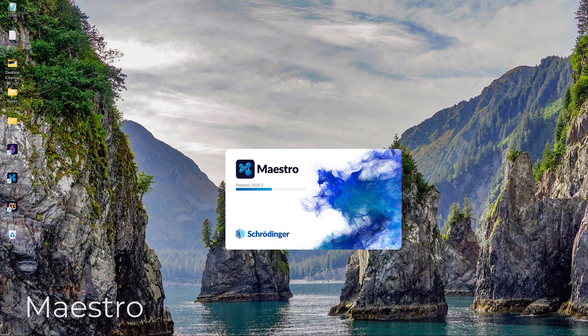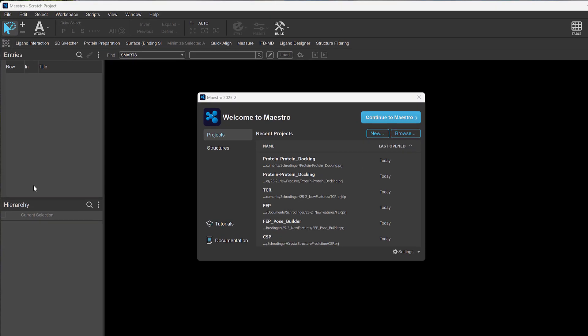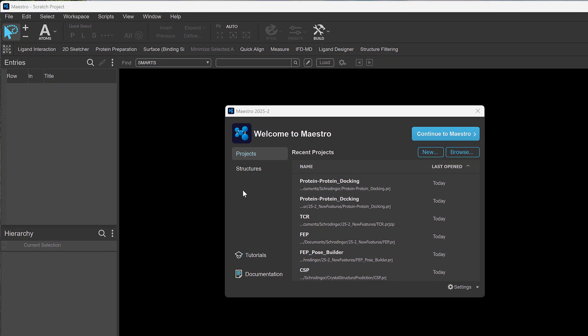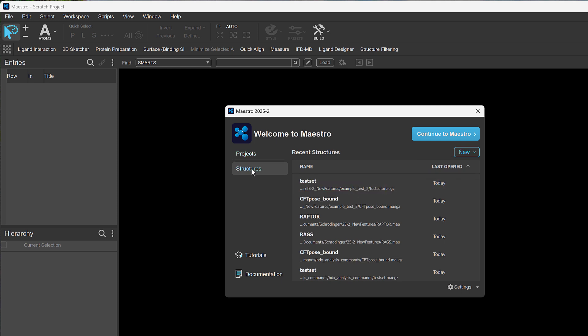Finally, we've introduced significant enhancements to the main Maestro interface for a smoother user experience. On startup, you'll be greeted by a new welcome screen, providing quick access to common tasks like opening projects or importing structures.